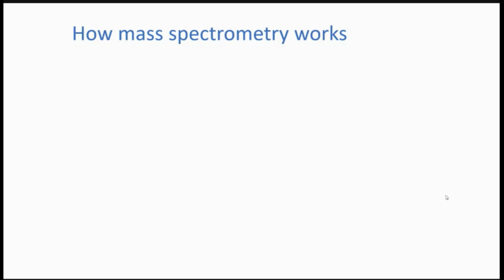Today is the introduction to mass spectrometry, where we left off last week after the introduction to liquid chromatography that I gave. And we're going to start with a really basic overview of how mass spectrometry works.